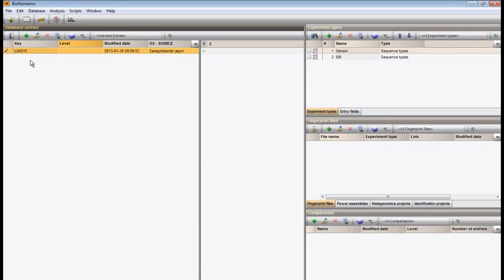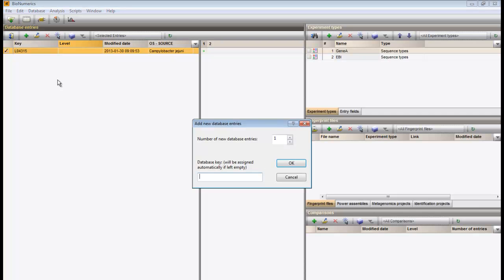I start by adding a new entry to my database, to which the assembly project will be linked.